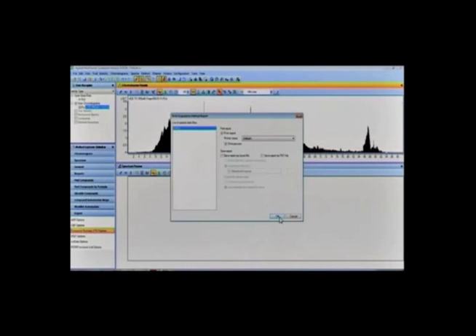By clicking on the print option followed by acquisition method report, we can get the LC-MSMS method which was used for the data acquisition.